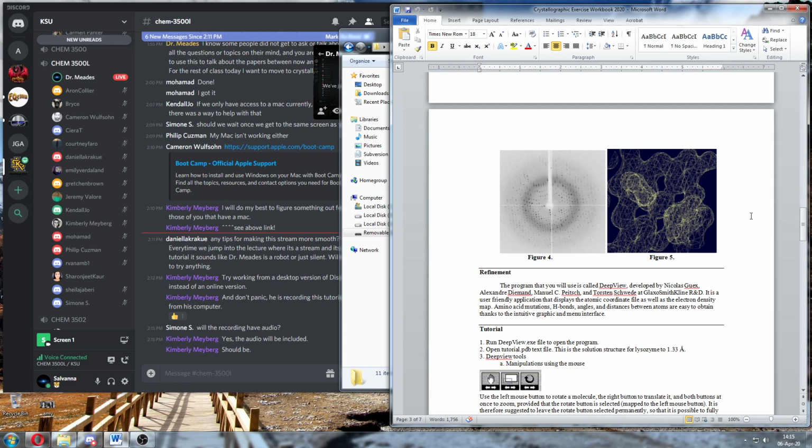We won't get into the Fourier analysis of how you convert reciprocal space to real space and so forth. You don't have to do all that. But these spots tell me something about where the electrons are in real space. So the closer they're spaced here, the farther apart the electrons are in real space. The farther apart they are here, the closer they are in real space.